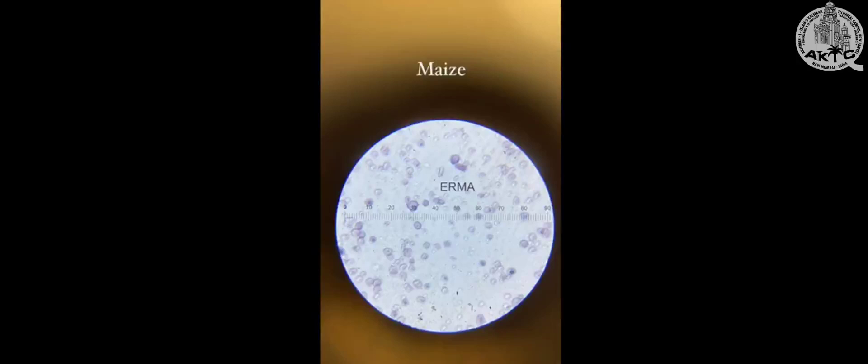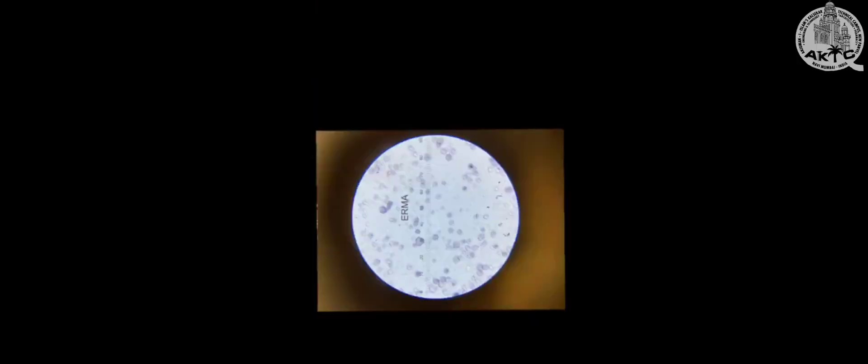As you can see the grain on 16 on the scale, we have to measure the breadth by counting the lines. So here we got 4 as breadth. Now we have to rotate the eyepiece vertically and count the lines on the same grain as length.